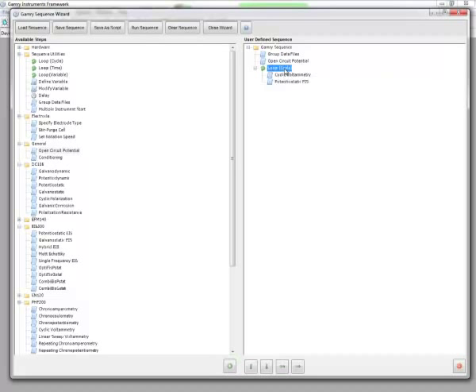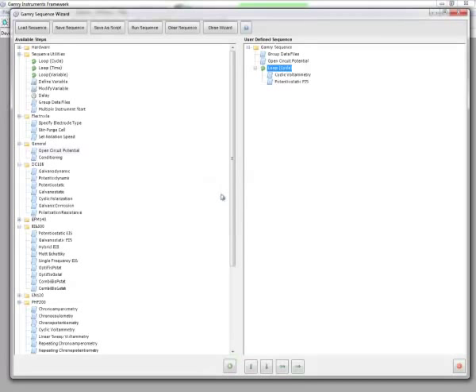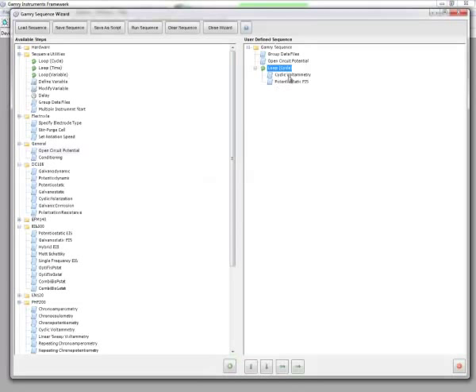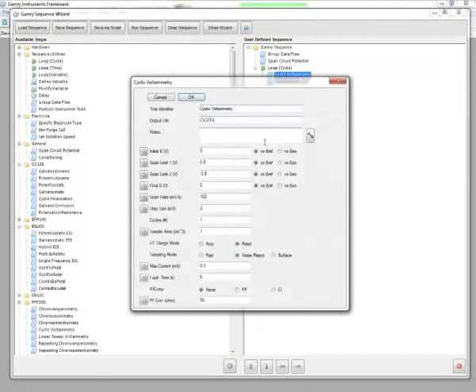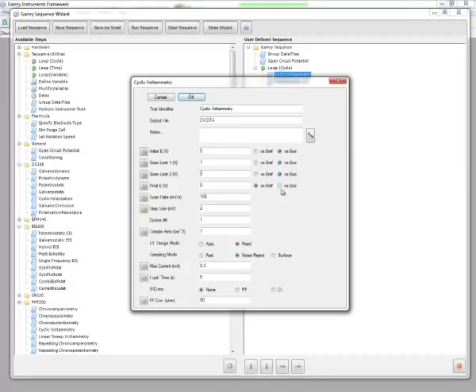So we're going to loop based on Cycle. Let's say we want to run this cycle, this loop, 10 times. I simply click on 10. And then I set up my CV parameters just like you would for a normal stand-alone experiment. So I'm going to start at open circuit, I'm going to go 1 volt positive, and then I'm going to run back to open circuit. Scan rate would be what your typical scan rate might be, and the rest of the parameters are just like an individual experiment.